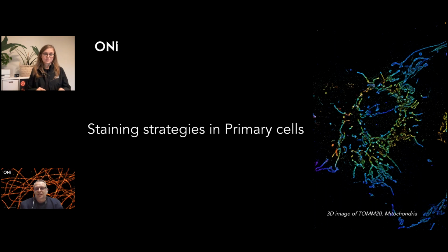It's basically a dichroic mirror, so it's a split. In this case, you will see on one side of the camera only your one fluorophore at 640 and on the other camera 560. However, in this case, you cannot do the 488 and the 560 channel simultaneously. But you can always perform it in a sequential manner, and by using the right filter settings, you can pick the right fluorophore.